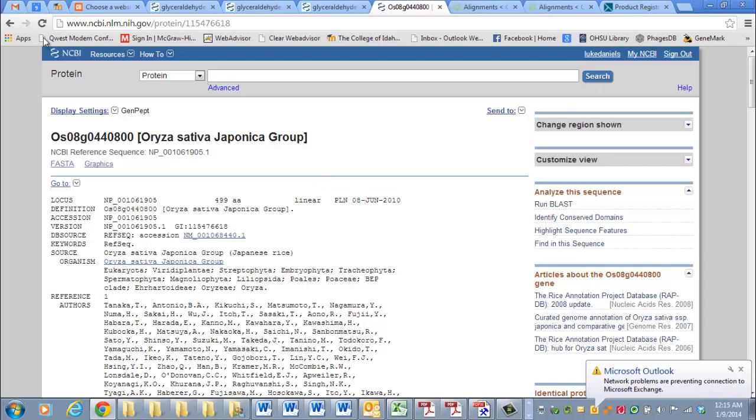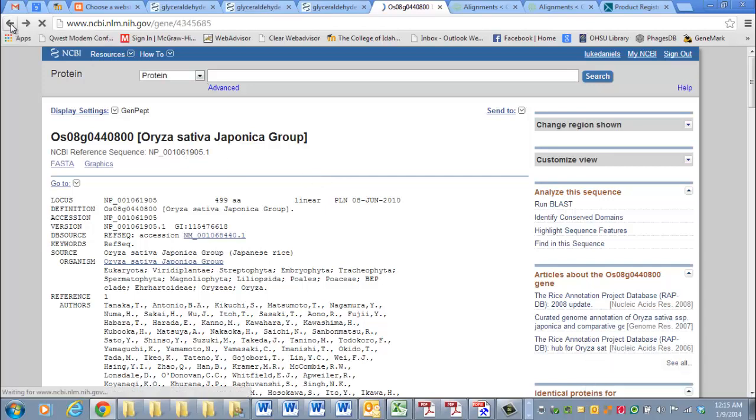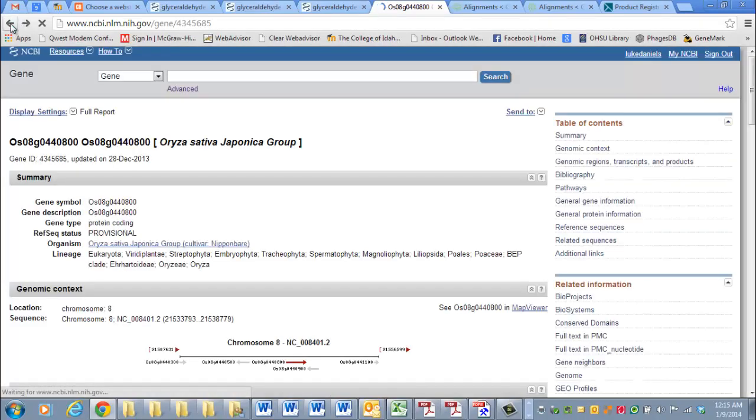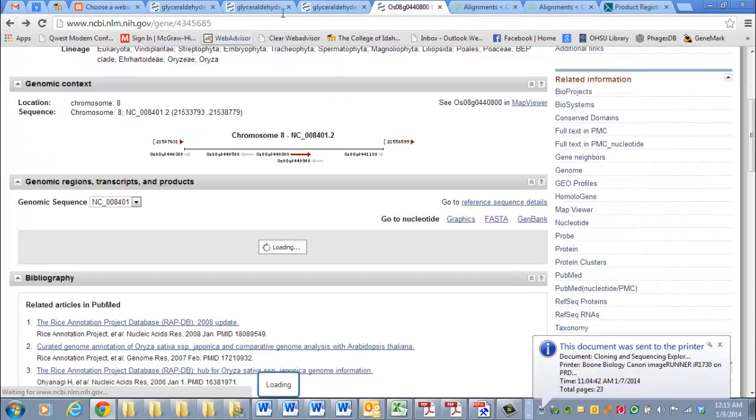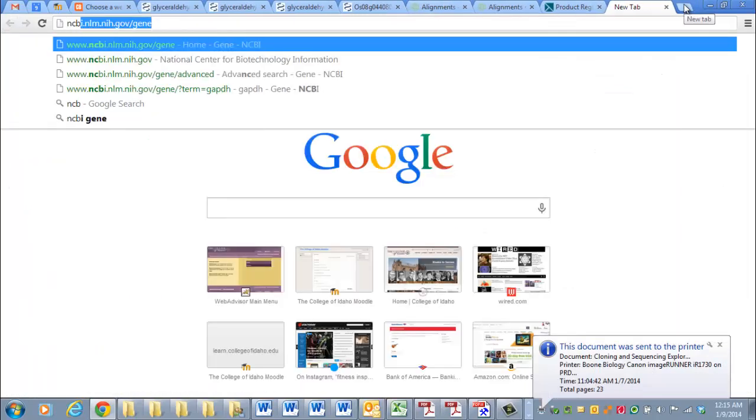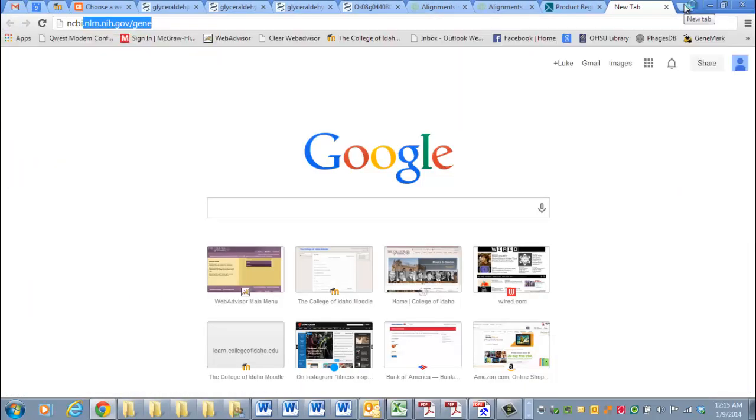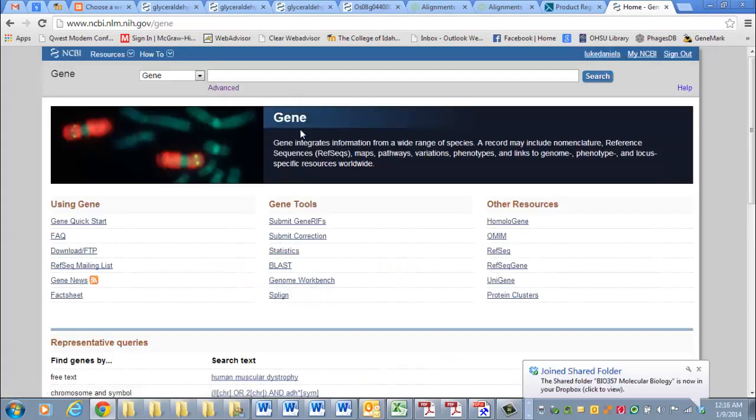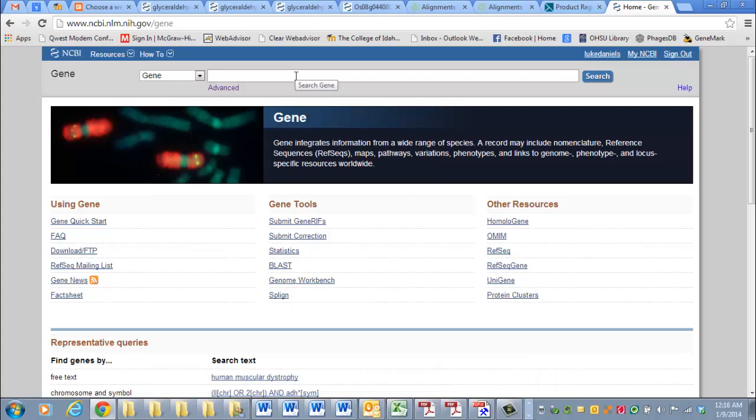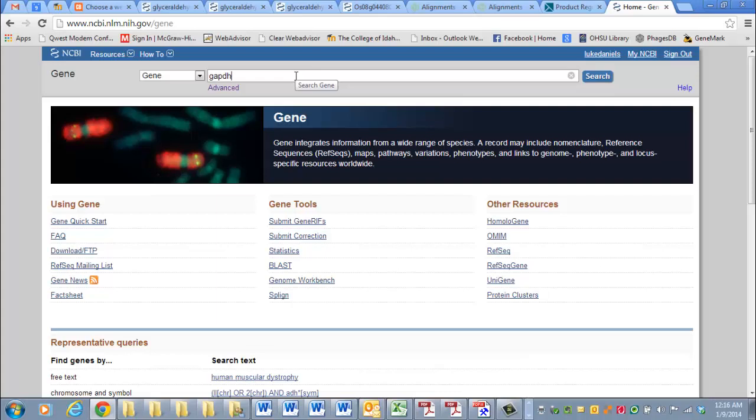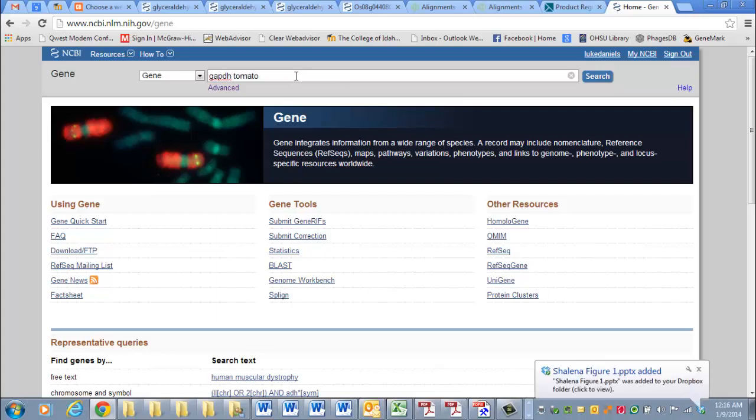For example, if I start back at this new tab and go to the NCBI site, NCBI gene, where you've been before, and then I type in GAPDH tomato.